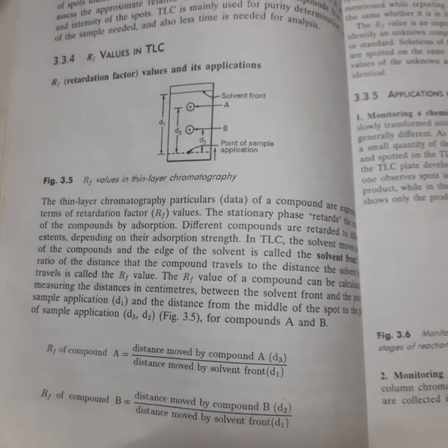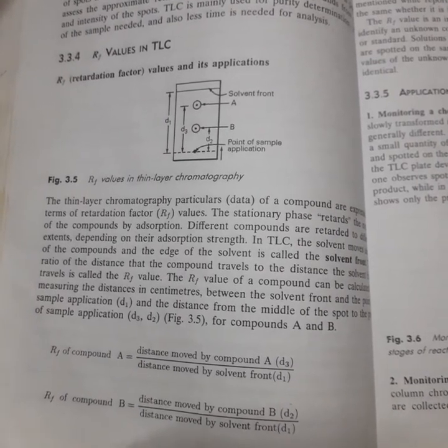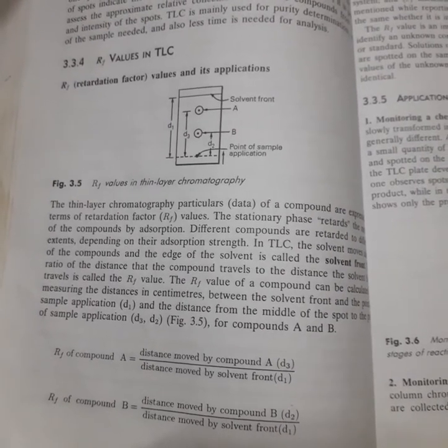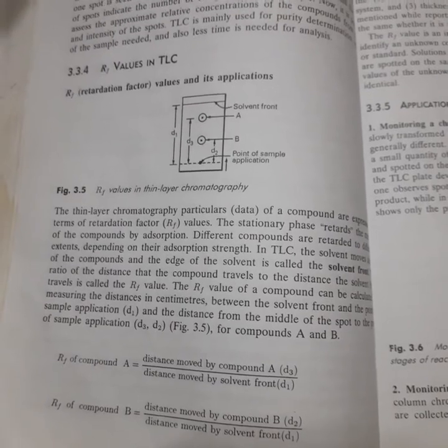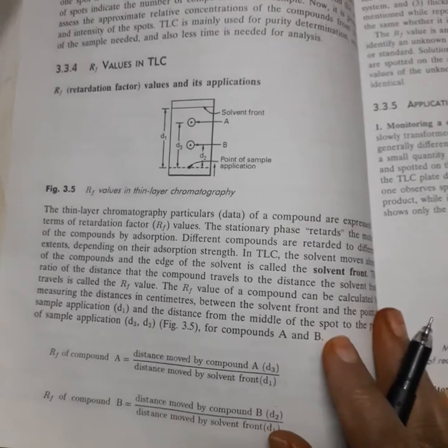So finally, TLC is the most widely used technique because we need very small amounts of solute and very small amounts of mobile phase, and moreover time is very important for everyone, right? In a very short period of time we will get highly accurate values by using this TLC.